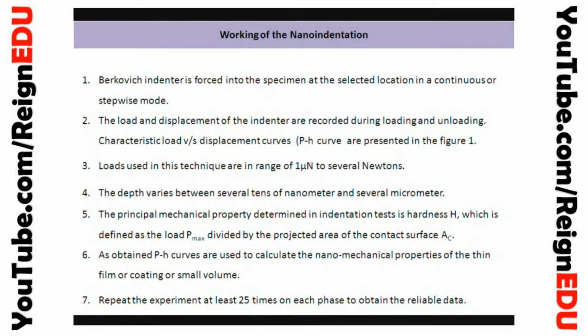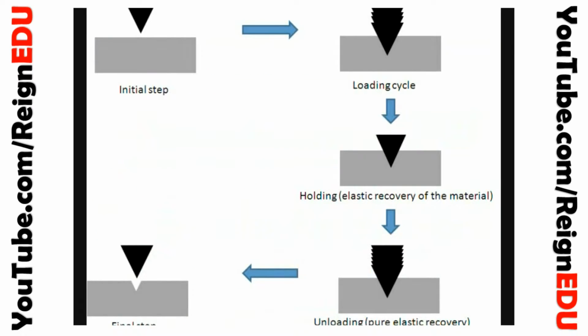Working of the nano indentation. A Berkovich indenter is forced into the specimen at a selected location in a continuous or stepwise mode. The load and displacement of the indenter are recorded during loading and unloading. Characteristic load versus displacement curves are then plotted. A schematic of the experiment is presented in this slide.